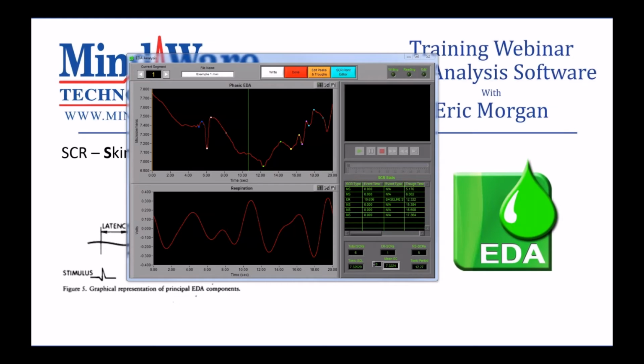Okay, so now we're on the analysis screen. And I'm going to talk a little bit about what we see here, what some of these different markers mean, the different statistics, and then we'll talk about editing a little bit. So the chart that's at the top is labeled phasic EDA, and this is your EDA signal. And it's marked with several color-coded complexes, which are the SCRs that have been identified in this segment.